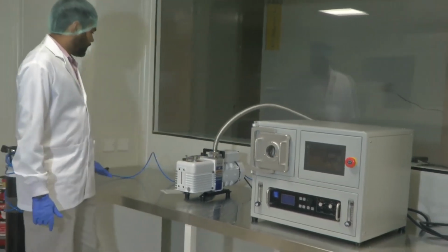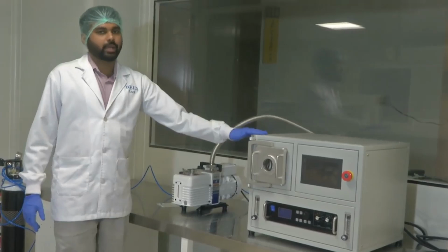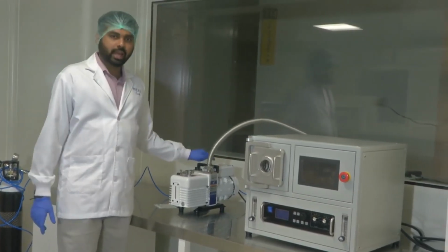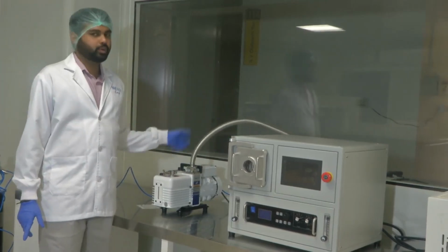Okay, and then the power to the pump comes from a main supply unit on this board. So we just need to connect the power supply cord of this vacuum pump to this main unit, and power will come to that from the main unit.